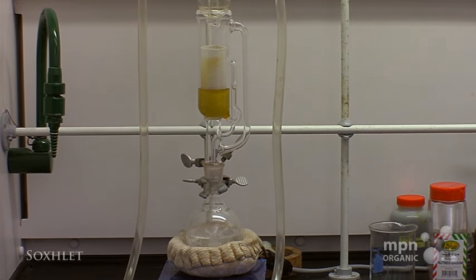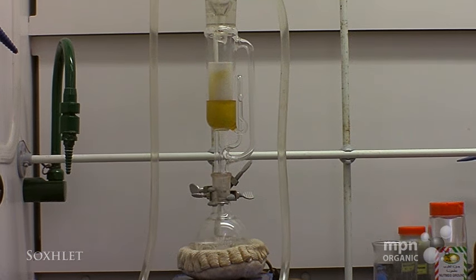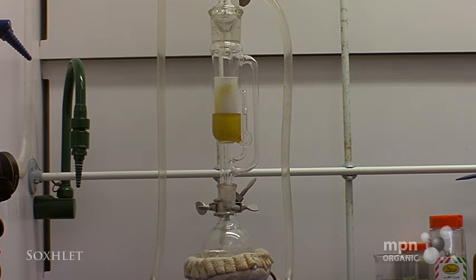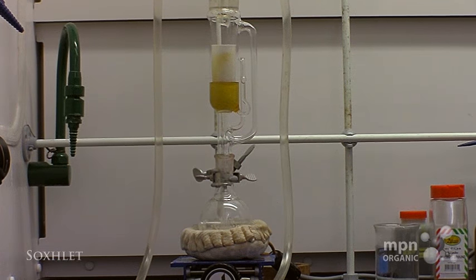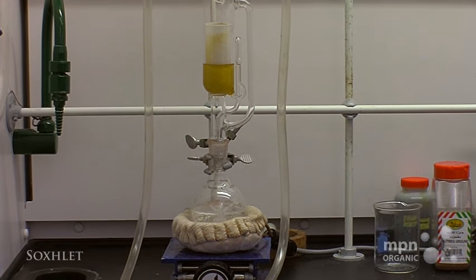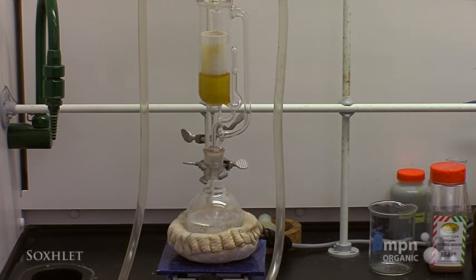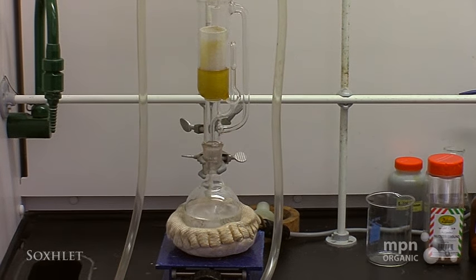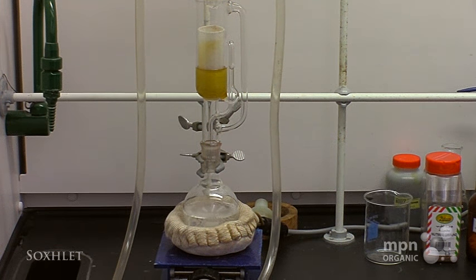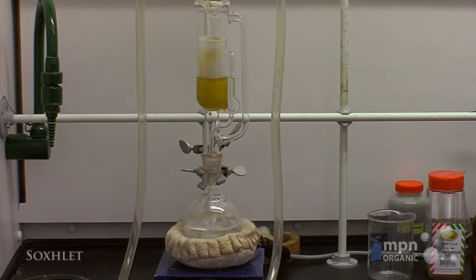Notice that there is no solid coming through the thimble, and that's because it is a piece of filter paper — that's what filter paper is designed for. The level of the solvent in the round bottom flask is going down because the solvent is being evaporated up into the condenser and filling up the thimble. Eventually the thimble is going to fill up to the point where the solvent will drain out, back down into the round bottom, over and over again. This is an ideal technique for extracting a low-solubility material from a solid matrix like we have here.